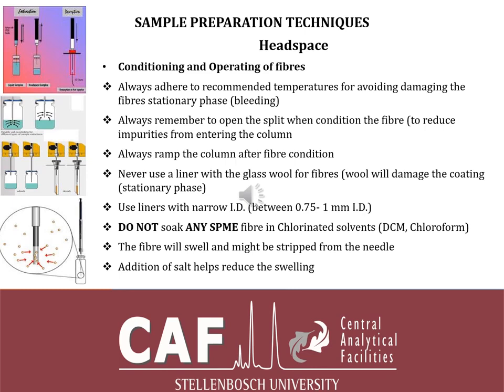So the question one might ask: what if I have to analyze for chlorinated compounds in my sample of interest? You definitely have to make sure that your sample is in a more watery medium. Maybe one can first dissolve the sample in methanol, or maybe in acetone, to break down the chloroform, the chlorinated solvent, and then also add a little more water, because the most important thing is not to have more of the chlorinated compounds in there.